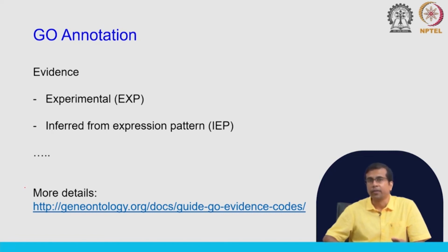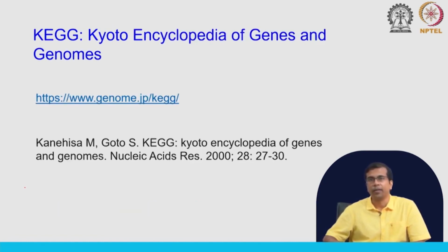All these things are given in the annotation part, showing how strong the actual evidence is for that functional association. Again, you can go to the link and see the details.